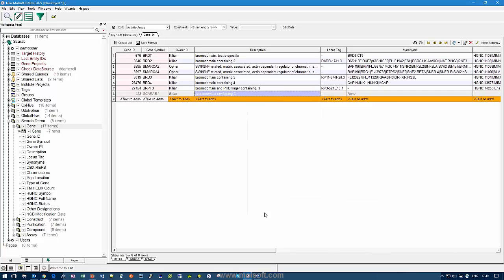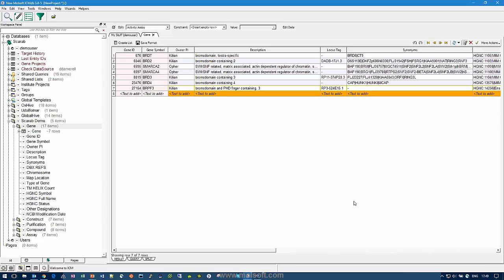So let's just see if this will behave. And see, it's gone. So that's how we edit data in general. It is not fancy. It is not particularly 100% user-friendly, but in the context of the way we work in our workflows, this works just fine.